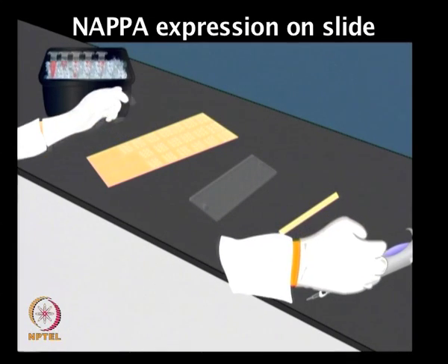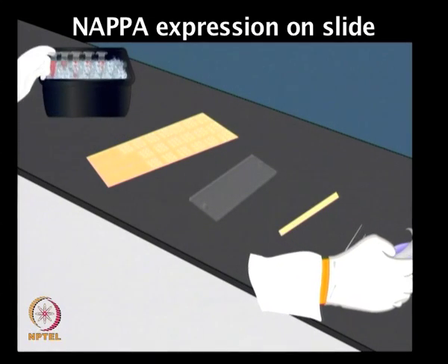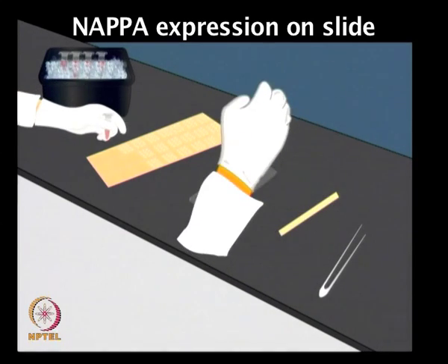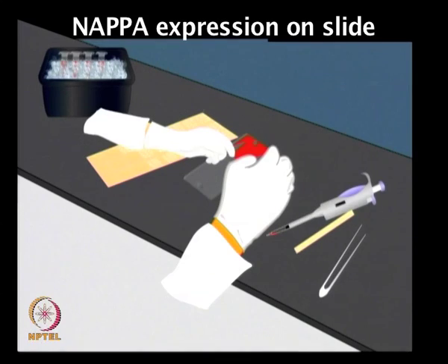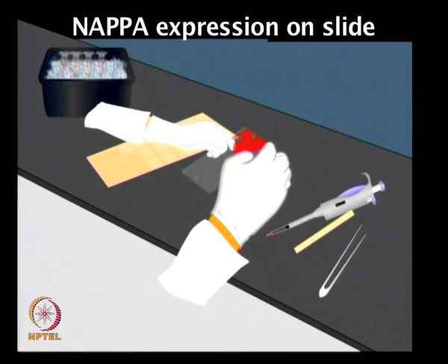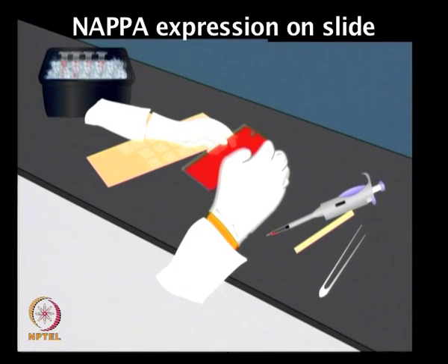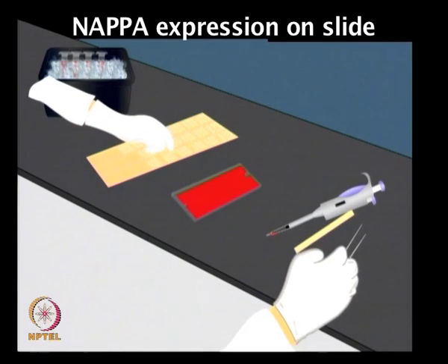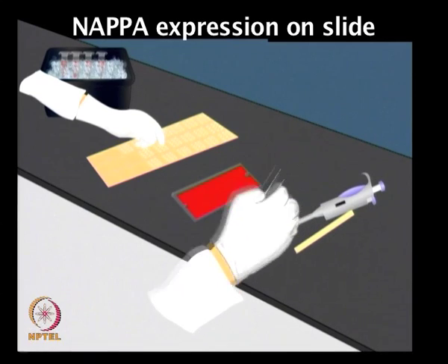So, first you need to prepare the in vitro transcription translation mix, which contains TNT buffer, T7 polymerase, amino acid, RNase inhibitor and DEPC water. Apply that on the slide, which contains the HybriWell gasket, and then seal the ports.